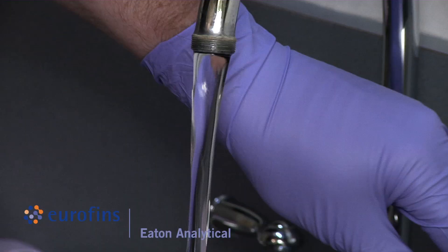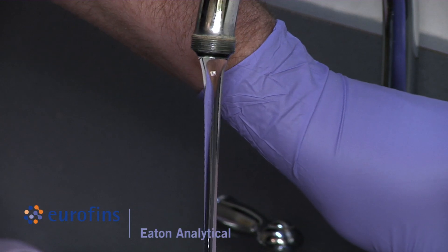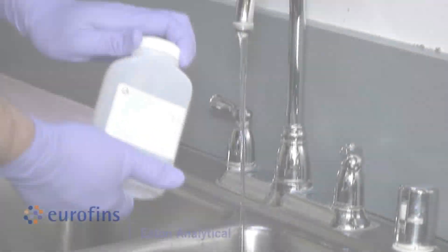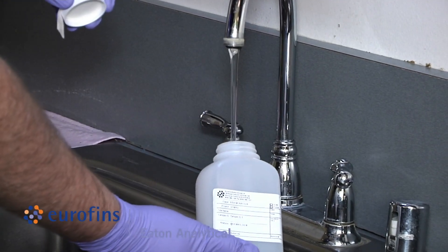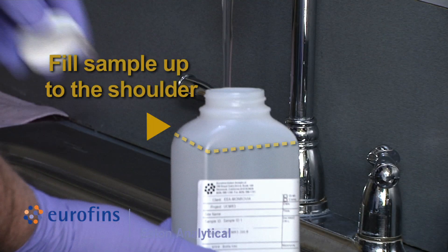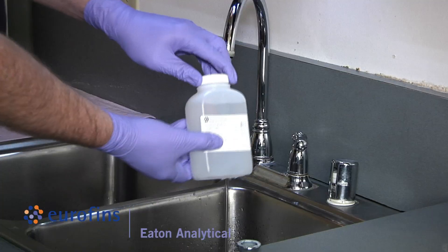After five minutes, slow the water flow to the thickness of a pencil to minimize splashing. Start sample collection by filling the sample bottle up to the shoulder, taking care not to flush out preservatives and making sure the mouth of the bottle does not come in contact with anything other than sample water. Cap and invert the bottle at least five times to mix the sample with the preservative.